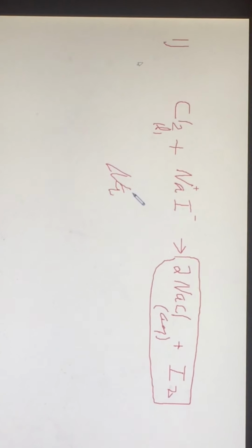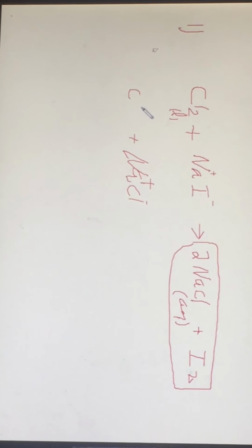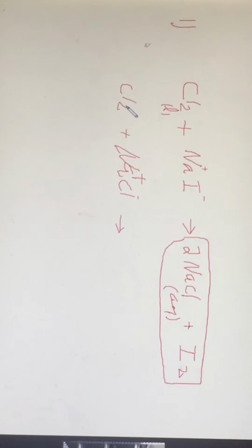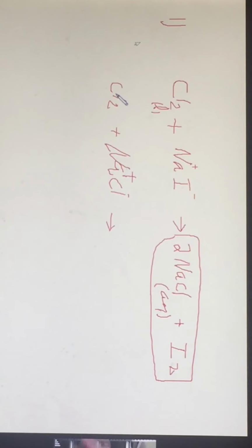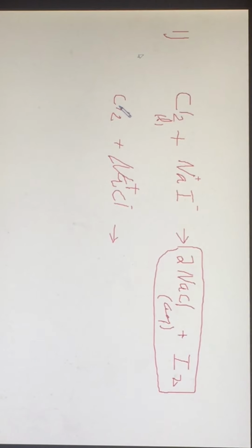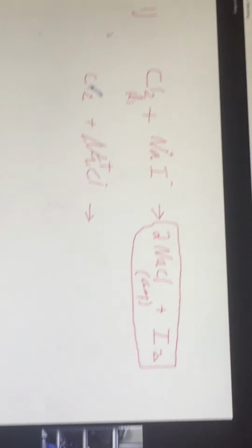What if you have sodium chloride? How is that test of sodium chloride with the chlorine water going to turn out? Will it tell us anything? Because the chlorine itself is kind of clear, depending on how many times that bottle has been opened, and whether someone forgot to cap it. How much chlorine is left in that water will tell the color.